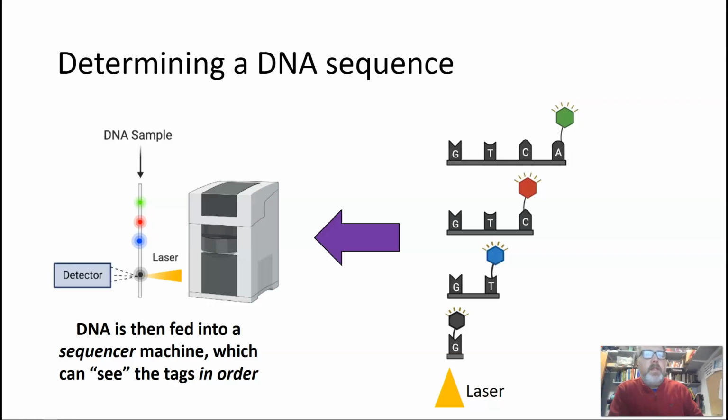So for example, this one, it hit the first G in the sequence, grabbed one of those fluorescent bases, so boom, all it put on there was the G, and then it fell off. Next one, the G is a normal base, and then it grabbed a fluorescent base for the T, boom, fell off, right? So it goes through, it does this all the way down, hundreds and hundreds, if not thousands of bases, right? It keeps making these randomly, and so it'll keep making longer ones, shorter ones, right? So eventually, law of averages, randomly, the entire sequence has been copied, right, all in different lengths.